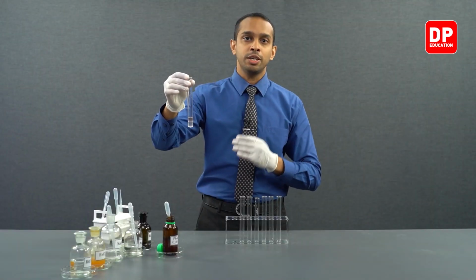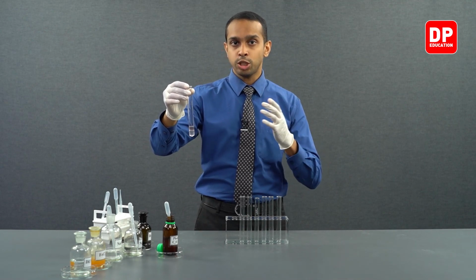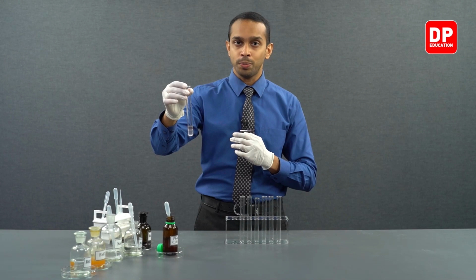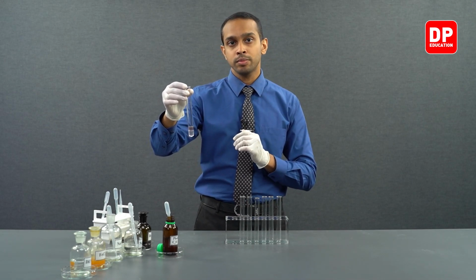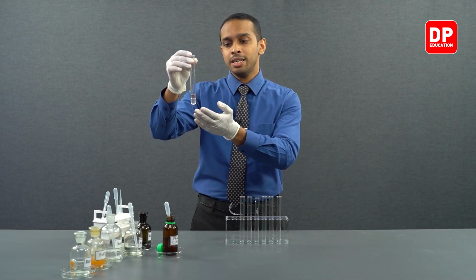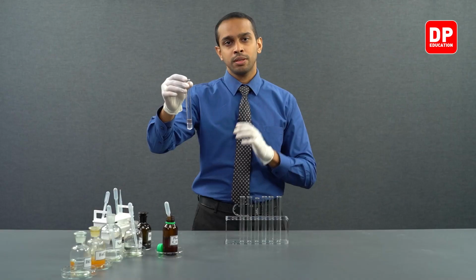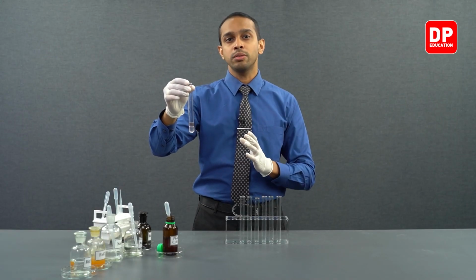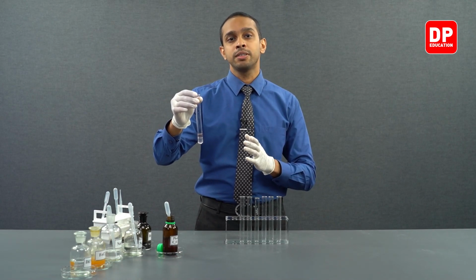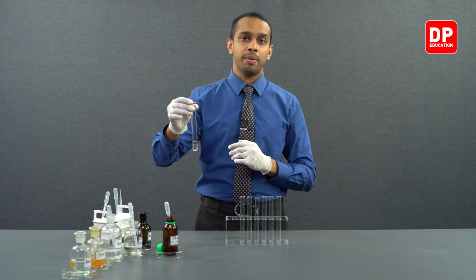And the color of the phenol still persists, indicating phenol did not become phenoxide ion, because when phenol releases the H plus ions attached to the OH group, it forms phenoxide ion. This will allow the phenol to dissolve in water. You can see the layer separation is still very clear, indicating it did not react with sodium carbonate. This tells us phenol is not acidic enough to show a reaction between sodium carbonate or sodium bicarbonate.